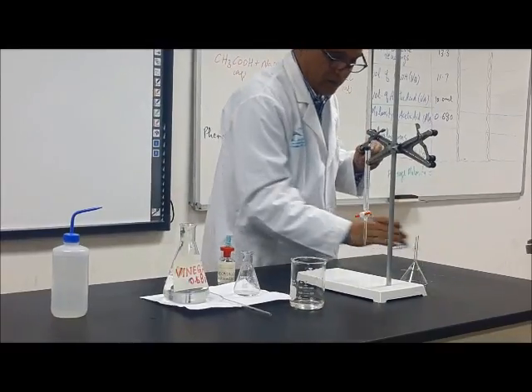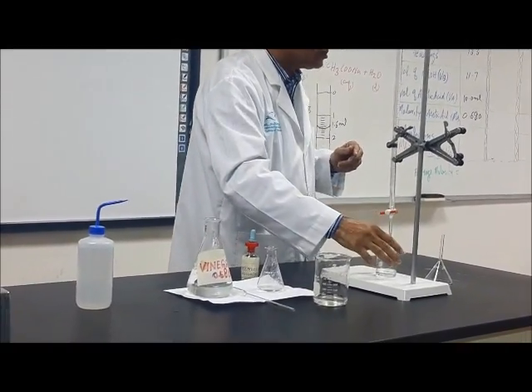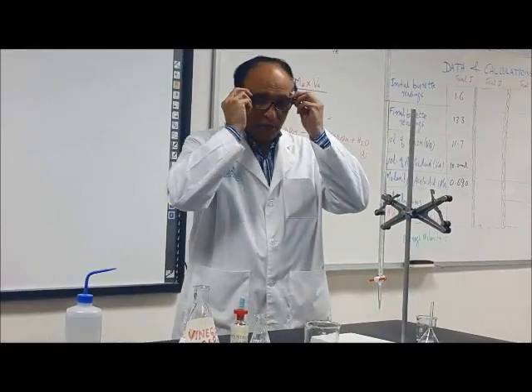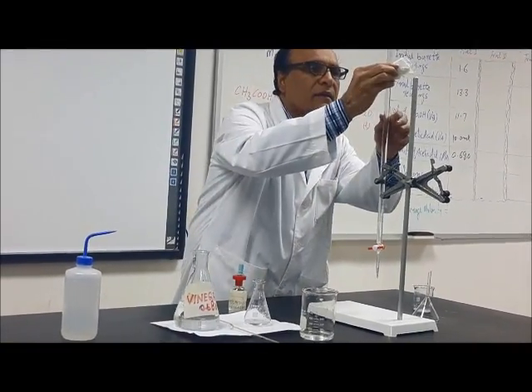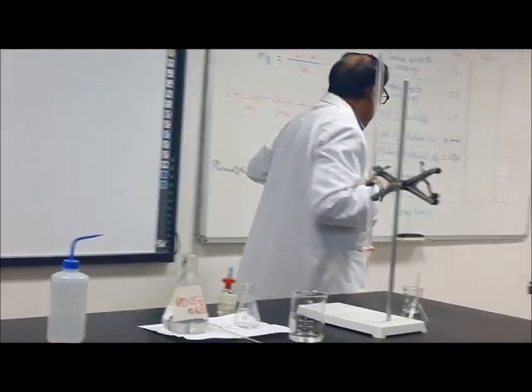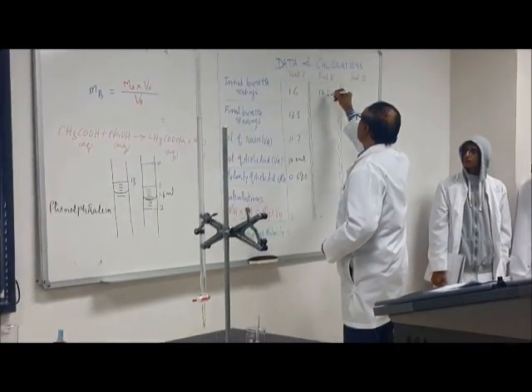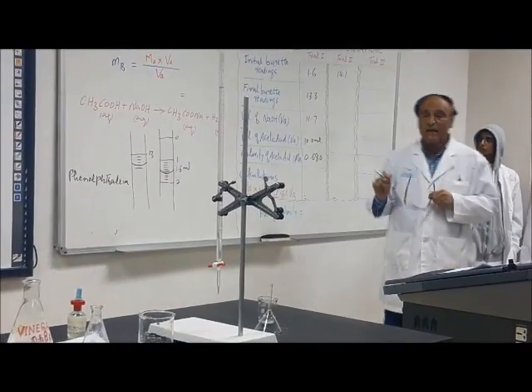Look, I'm changing it. Just to show you, intentionally I'm changing it, that you can start from any point. Alright? Now, I take this one and the reading is 14.1. This is the initial reading. Is that right? Yes. Now I ask some questions from you. This is my initial reading.